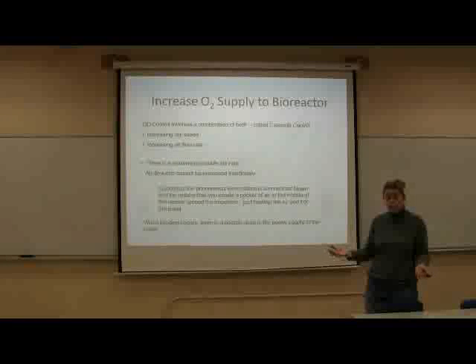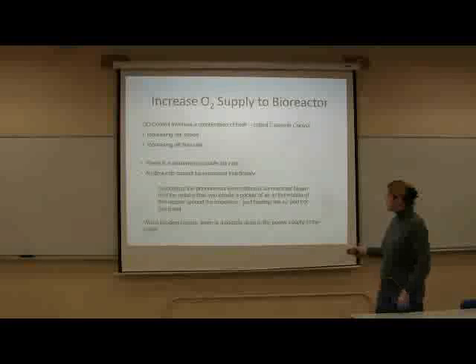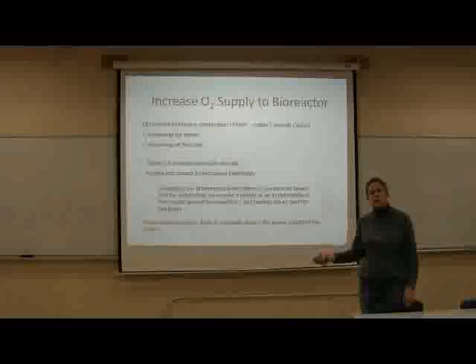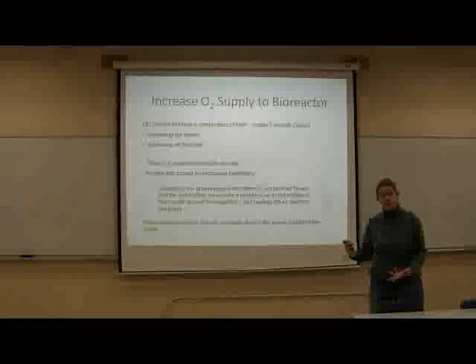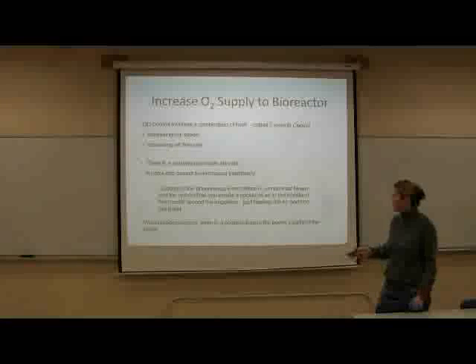You get no bang for your buck in that case, and this is called flooding. When flooding occurs, there's a notable drop in the power being fed to the mixer, because it's stirring air, so the demand for power on the motor goes down.